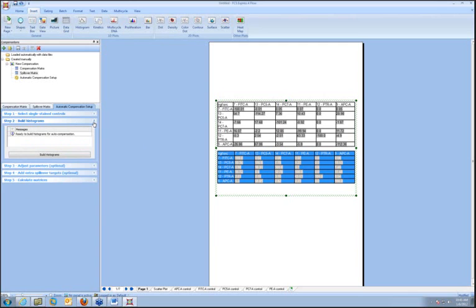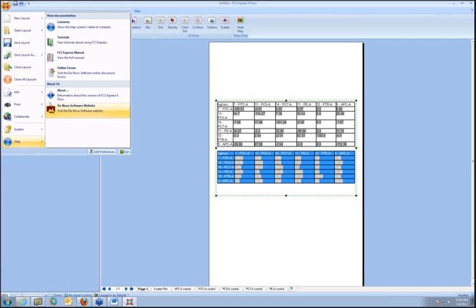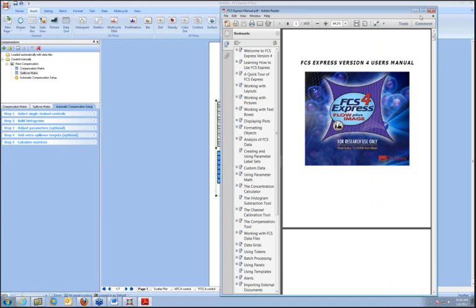We have both our printed version of our manual, and actually in the help system, you can just go to the compensation section, which is located over here, and it shows everything that I talked about. It describes it in detail.